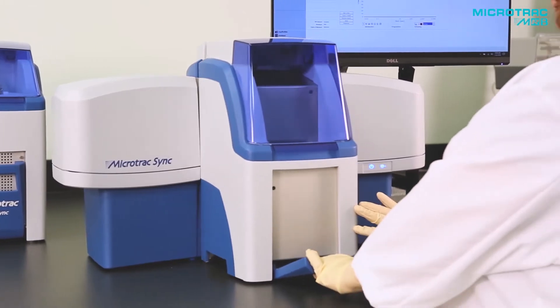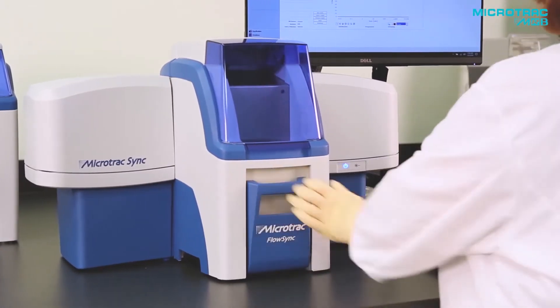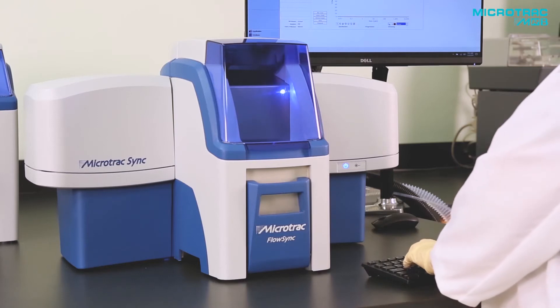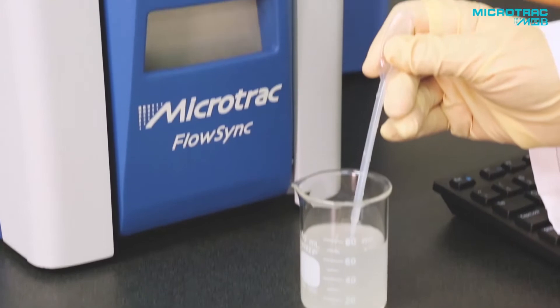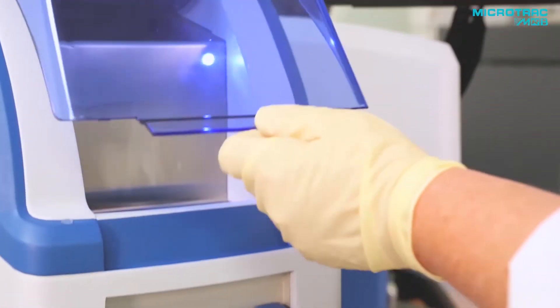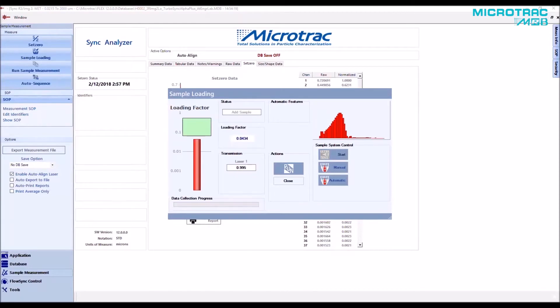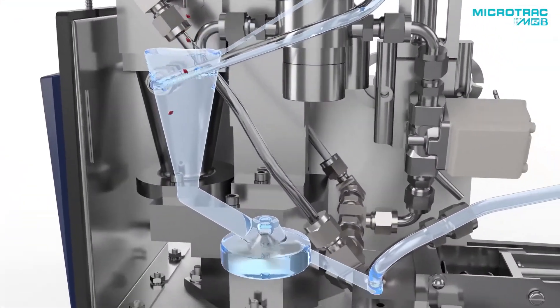Here we will highlight the new and innovative design features that integrate the power of laser diffraction with the versatility of dynamic image analysis. Let's start with a wet analysis. Sample is introduced to the flow sync and disperses throughout the flow system. The measurement is initiated. The software will tell the user when enough sample is loaded and a flow loop with fully dispersed particles is formed.